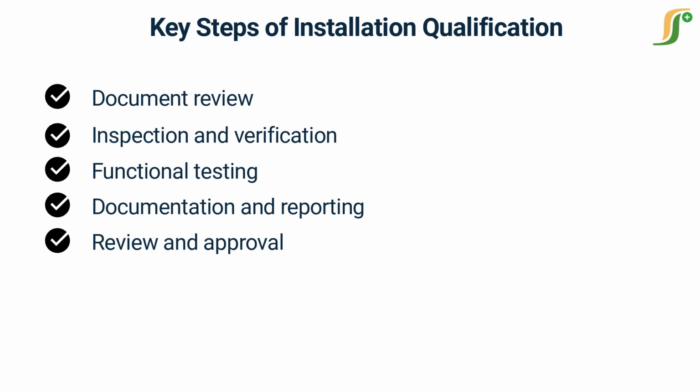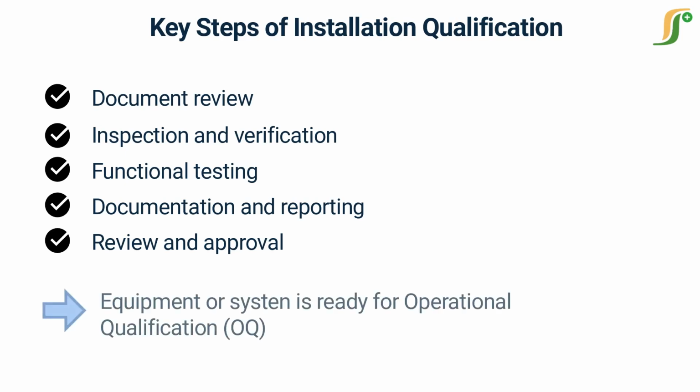The successful completion of an installation qualification process provides documented evidence that the equipment or system has been installed correctly and is ready for further validation activities, such as operational qualification and performance qualification, which focus on verifying that the equipment or system performs consistently and reliably within its intended operating range. IQ is an important step in ensuring that equipment and systems used in regulated industries meet the required quality and compliance standards.